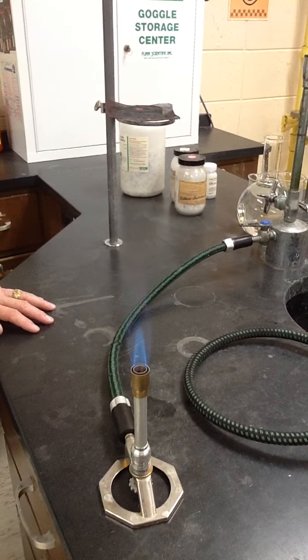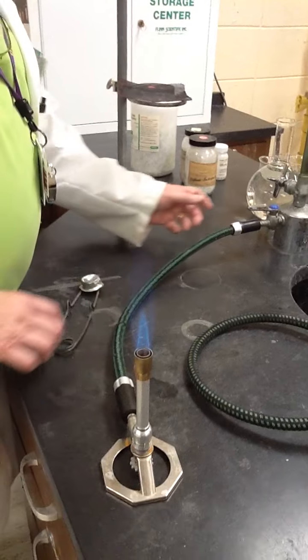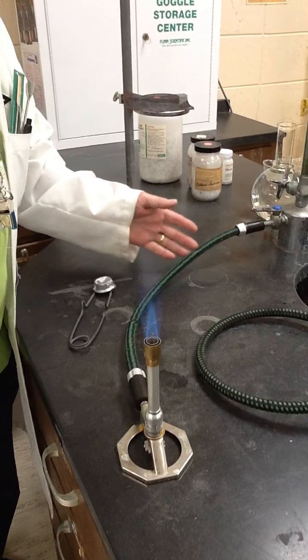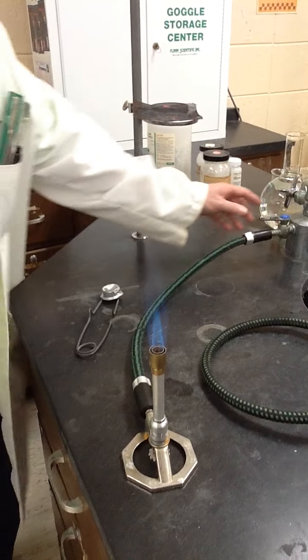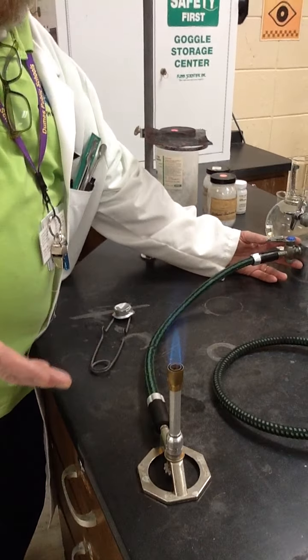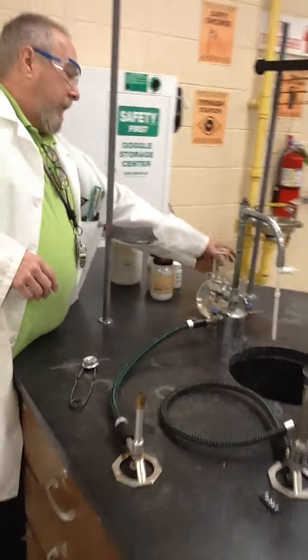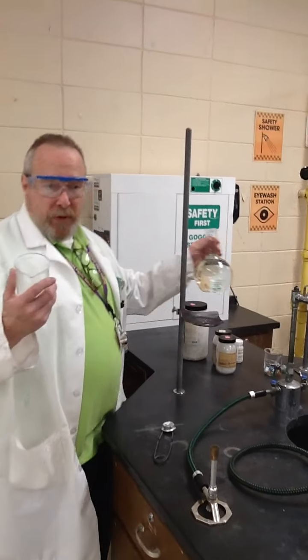But today we're just going to use this burner to boil water. One of the problems with boiling water, and I'm going to turn this off, I'm going to turn it off completely by twisting the petcock so it's perpendicular to the flow of gas. This way the gas is flowing out. I turn it off not by blowing it out, not by snuffing it out, but by turning off the gas supply.